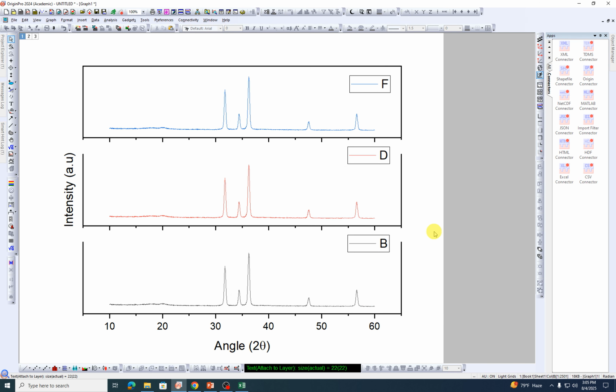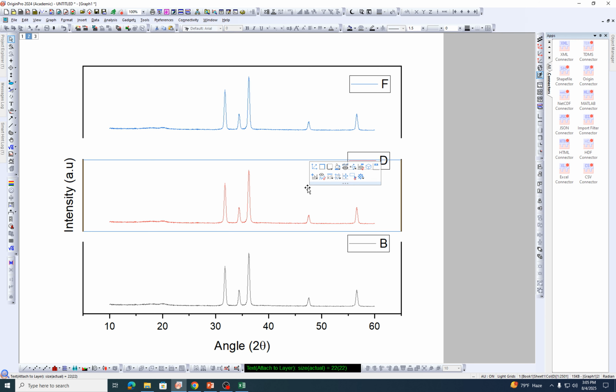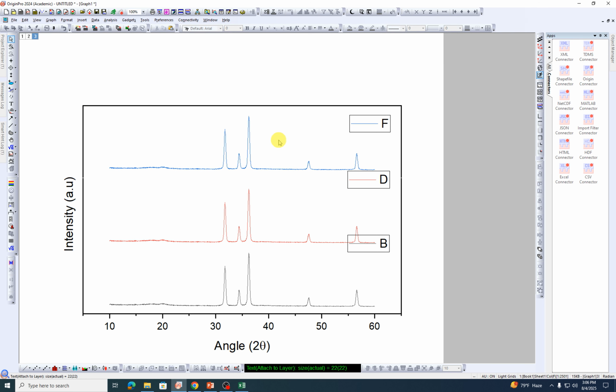Okay, so everything is here, so we don't need this line. Let's delete this. We don't need this line. Let's delete this. So you can simply match them. Yeah, almost. Now it will look like one graph. It's a bit slow, I'm sorry. The tutorial is getting longer, so I need to be quick. Okay, just match them. Okay, now you can see it looks like this.